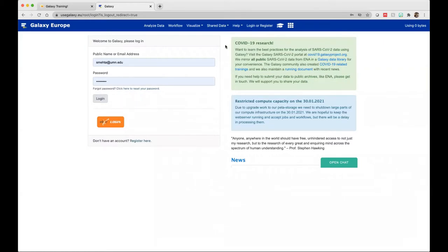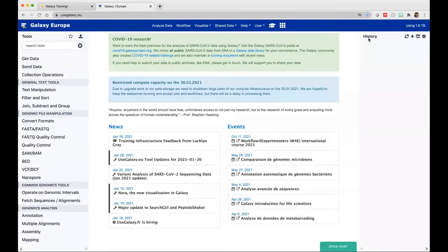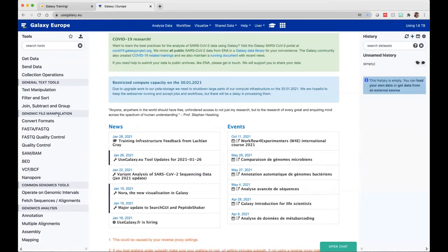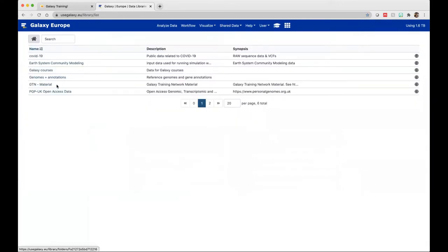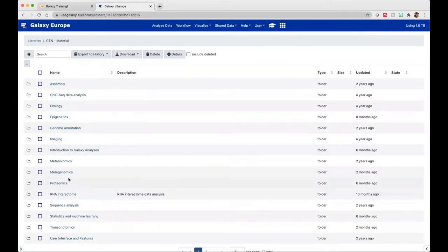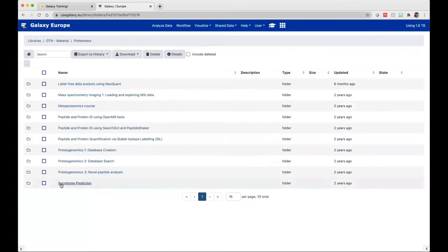The first thing I will do is log into the Galaxy server. Let's have a new history. This is how your Galaxy interface should look like. If you go to shared data and then data libraries, all the data required for the tutorial is present at the GTN material. Select that, and once you do, you can go to the proteomics part of the tutorial and select Proteogenomics 3 novel peptide analysis.